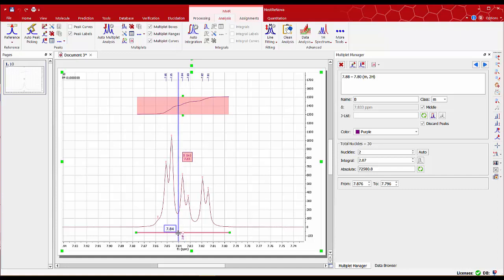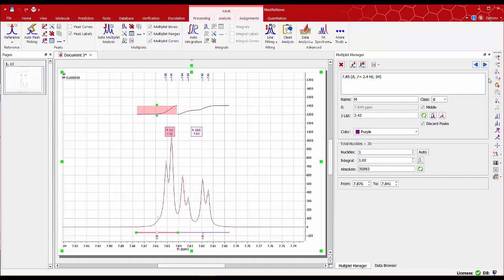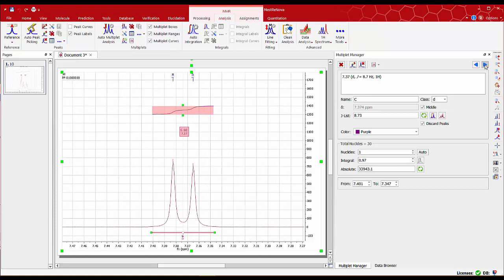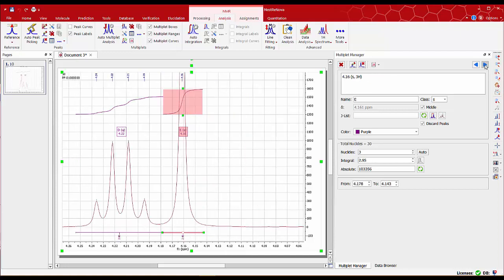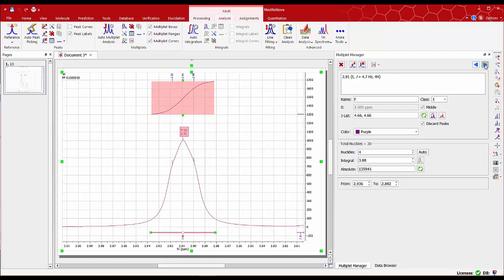For instance in this one we can split the integration into two. Check the other peaks and make sure they look right.